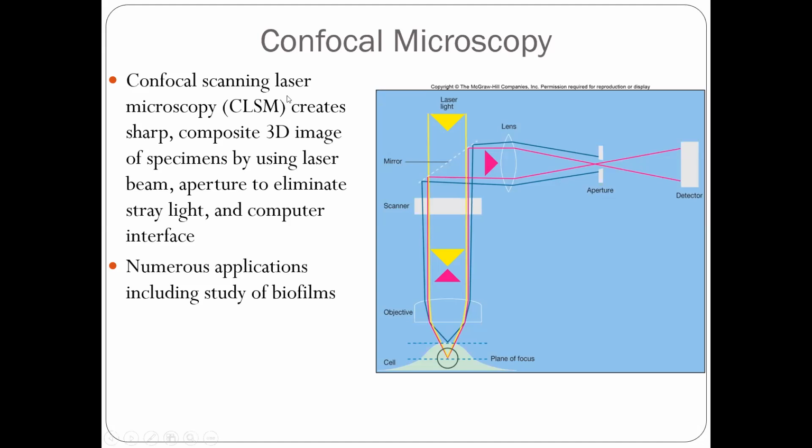And it is very good for seeing biofilms. So what are biofilms? That is a matrix of bacteria accumulated on a surface. Because they accumulate together, they transfer their signals, which we call quorum sensing, and they will be stacked together, very strong and resistant to sanitizers. That's a risk for the meat and food industry, especially for food contact surfaces. So that's where we need to do something about biofilms, and the confocal scanning laser microscope is a good tool to do the observation.